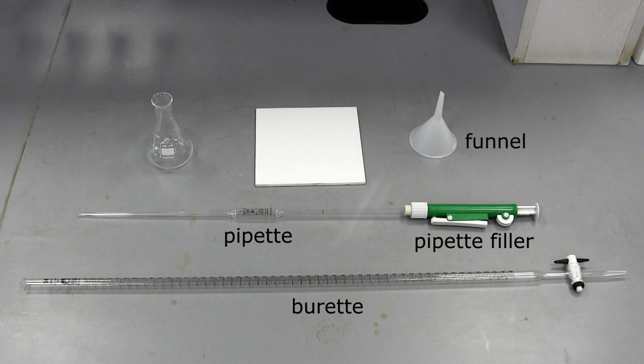The funnel is used to safely transfer a solution into the burette. The conical flask is where the reaction will occur. It is designed with a wide base so that it is easy to see the colour change, but with a narrow neck so it can be held and manipulated easily. The white tile is put under the conical flask, again, to see the colour change easily.